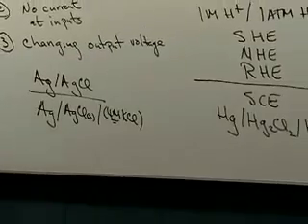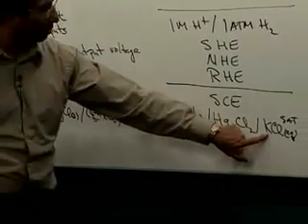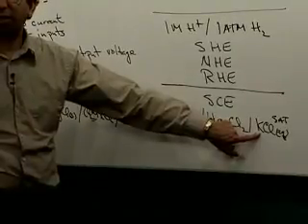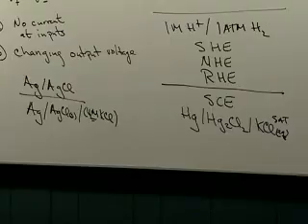What else do we have? Sometimes potassium is an issue in an electrochemical cell. You don't want any potassium ions around. For example, if some of you like to use perchlorate salts as your supporting electrolytes, usually you use sodium perchlorate. Works great in aqueous solution.